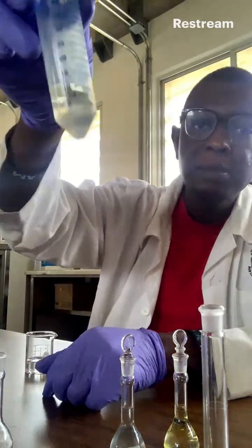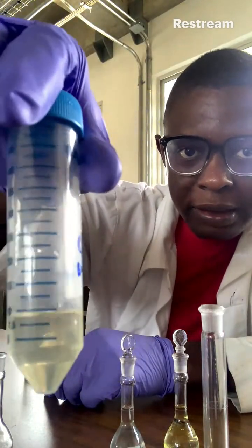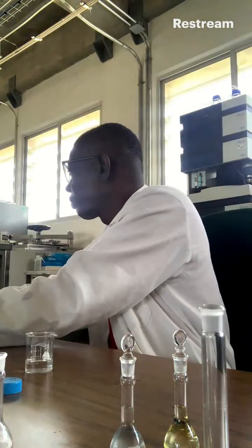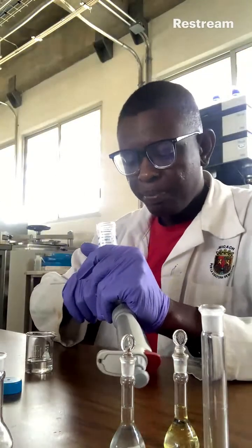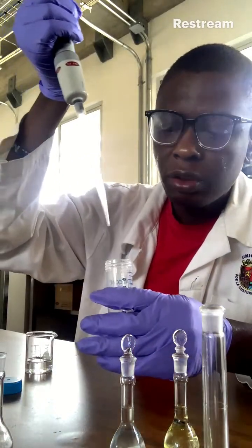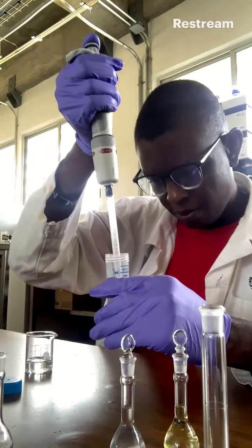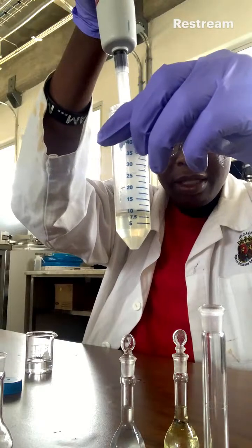Now I'll be working with my GC banana. This is my glycerol carbonate that I prepared using banana as the catalyst. So what am I trying to do? I want to calculate the glycerol conversion to glycerol carbonate, and I want to calculate my yield and my selectivity. I will dip in and I will extract.